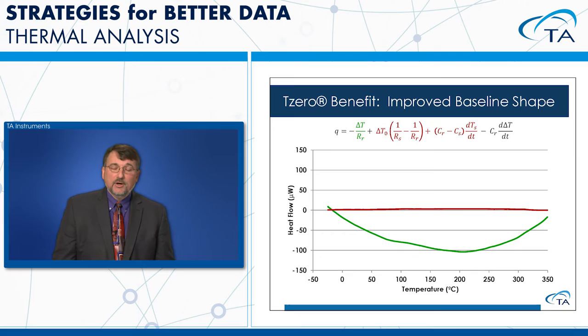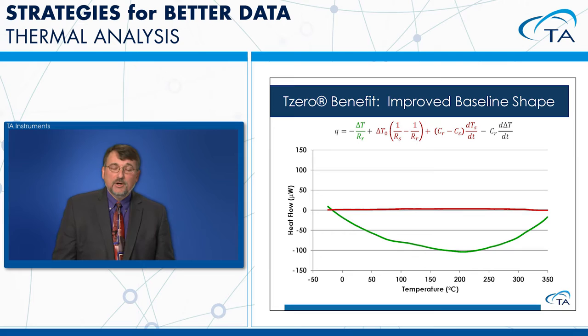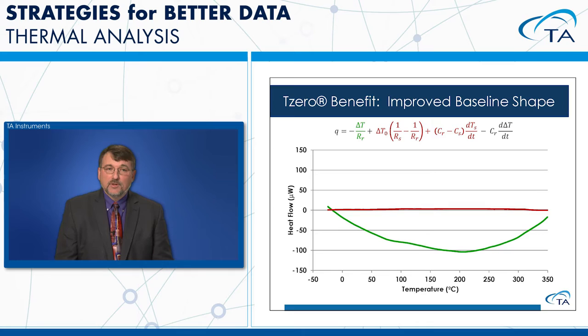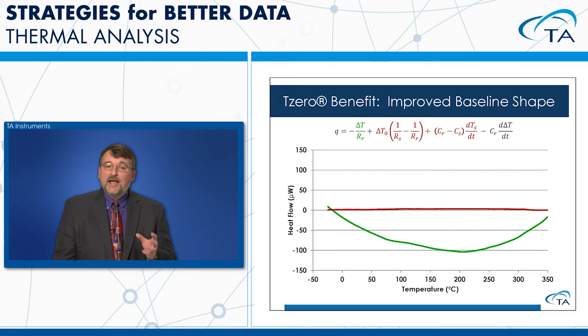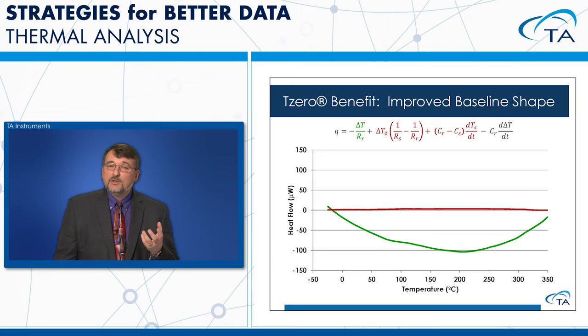The benefit of T0 calibration is demonstrated here. The green curve is a Q20 DSC, centered around zero but showing about 100 microwatts of baseline curvature. That's not bad compared to some DSCs on the market, but we believe it should be better. The Discovery DSC, shown in red, gives a nice flat line at zero — the best baseline performance.